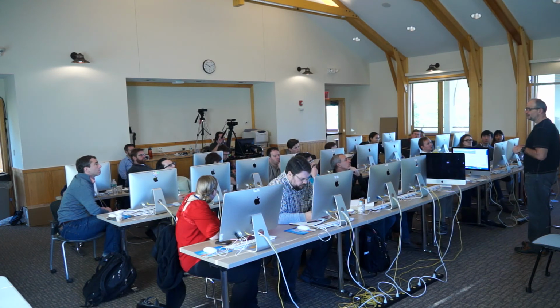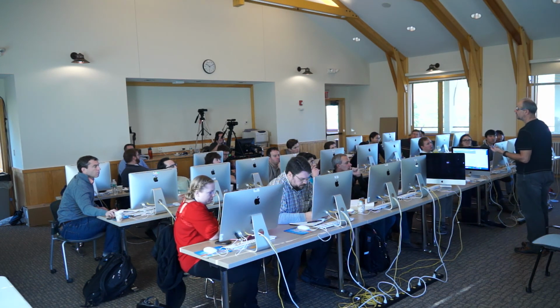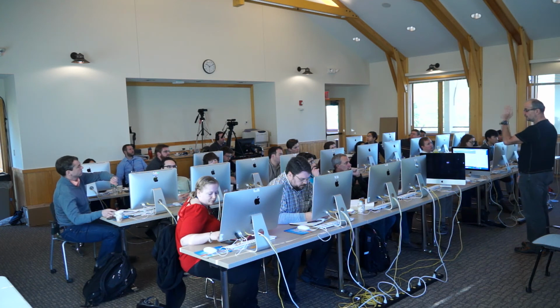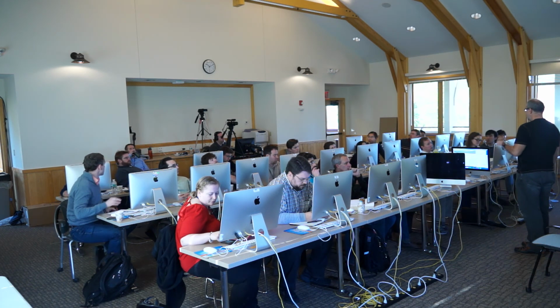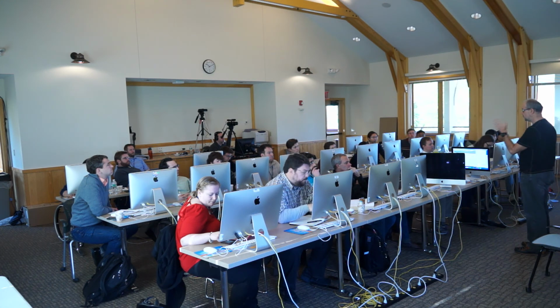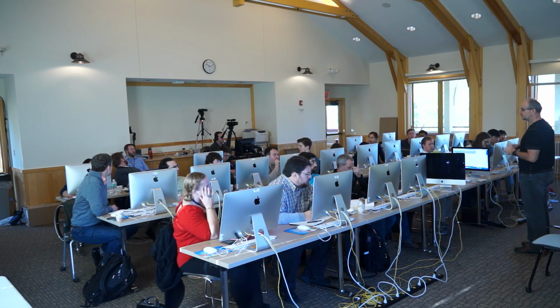So what you guys are going to be doing after this, I assume there will be a little break. And then after that, he's going to come on the scene, and you guys are going to be doing exercises for variant identification. He created some data sets, and you're going to do SNP calling primarily, or short variant calling primarily, right?